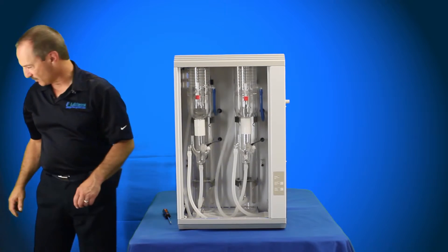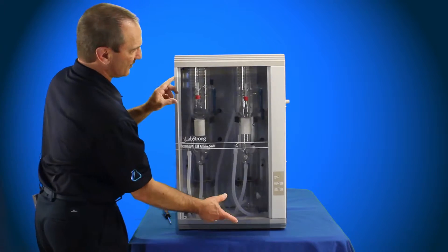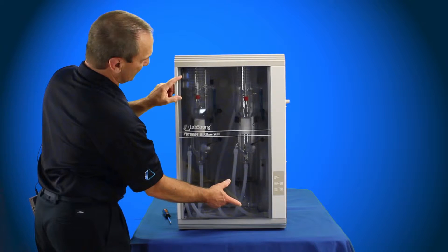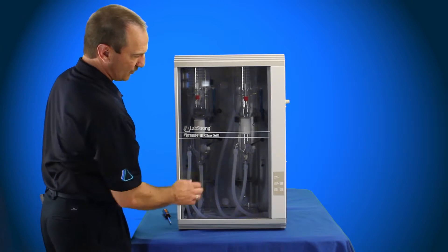At this point we can reinstall the door. Slide the top of it up inside on the front, the bottom slides down, and the door's back in place.